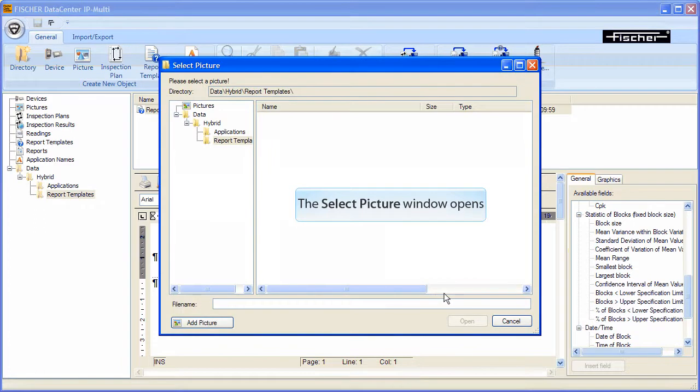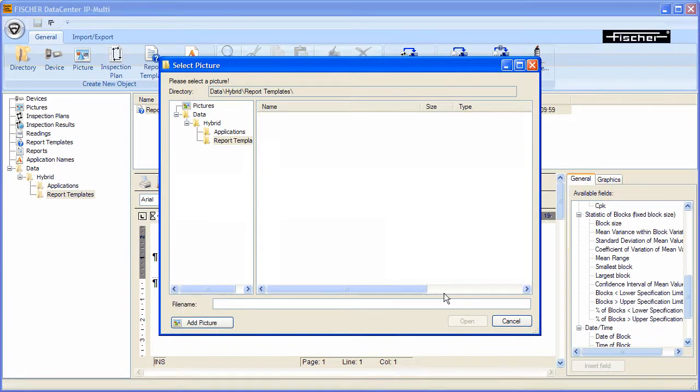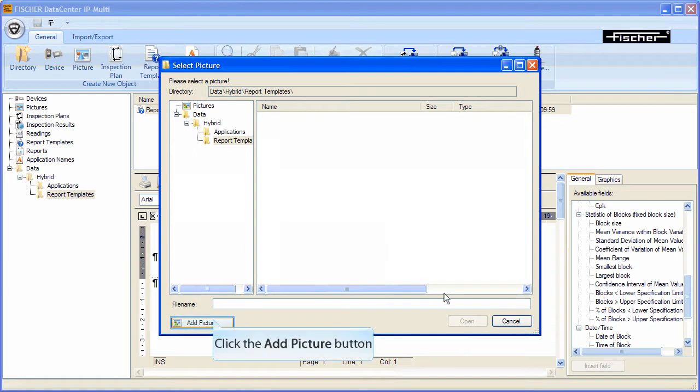A new selection window appears. So far no company logo has been inserted. For this reason, no image is available to be selected. Click add picture to import your company logo into the Fischer DataCenter.